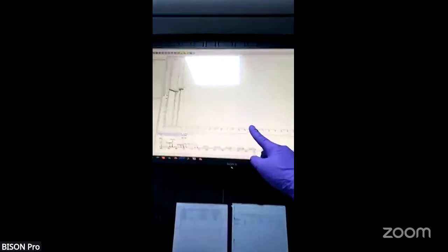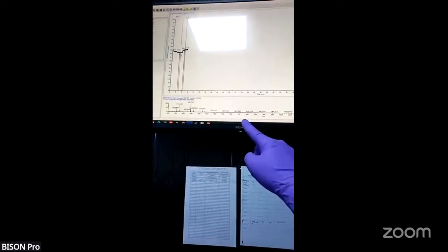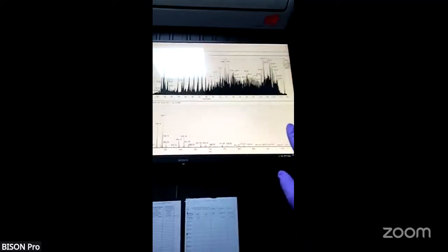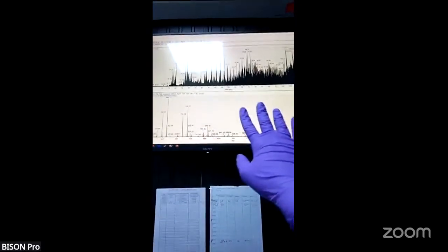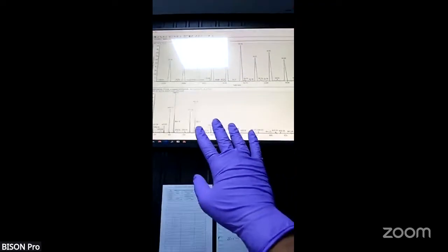The top is the MS acquisition or the chromatogram, and the bottom is the MS fragmentation. With each MS, we can open a chromatogram and show. So this is how a chromatogram looks like. This is a 120 minutes gradient. We can zoom in on a small region, and for each MS we can see how it looks.